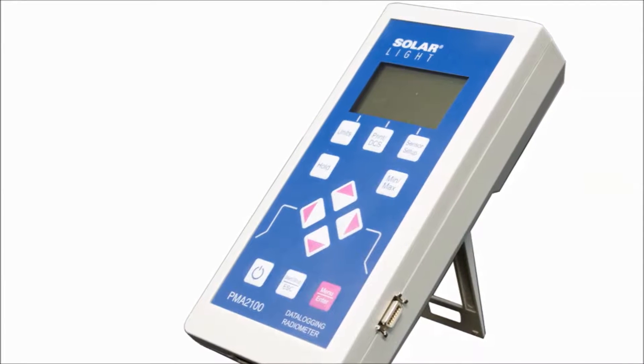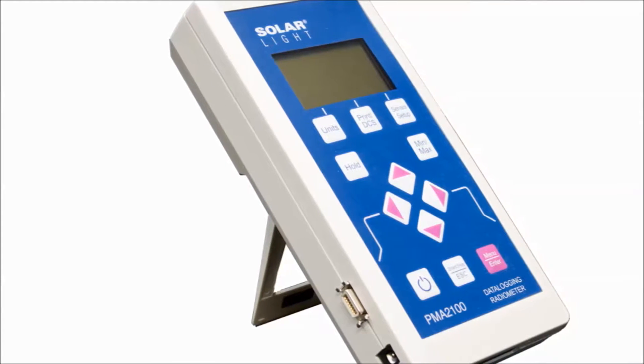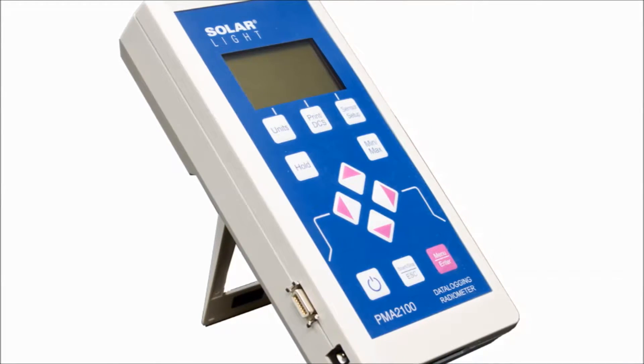They feature graphic display, data logging, complex processing algorithms, selectable units of measure, averaging, tracking minima and maxima, dose integration, and programmable alarm thresholds, all in a small handheld device.